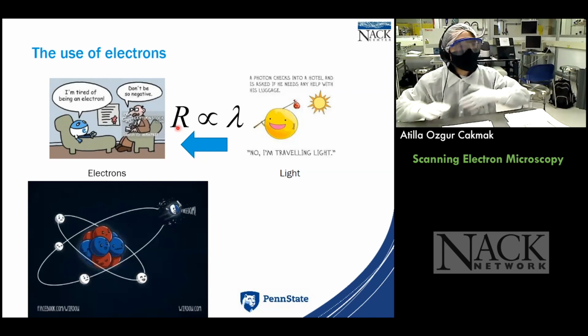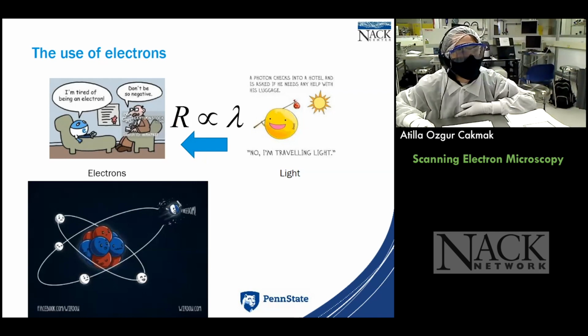All right, but then the first question that comes to the student's mind is, how does this really work? Because electrons are bound to the atoms, right? And they're just orbiting around, like I told you. So we need to create these free electrons. We need to create these, in a way, William Wallace electrons.